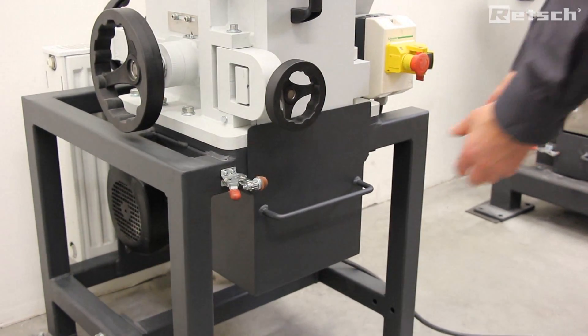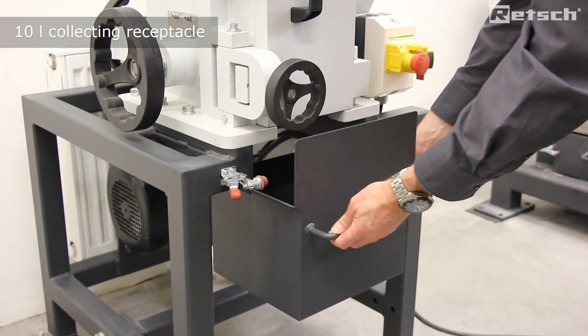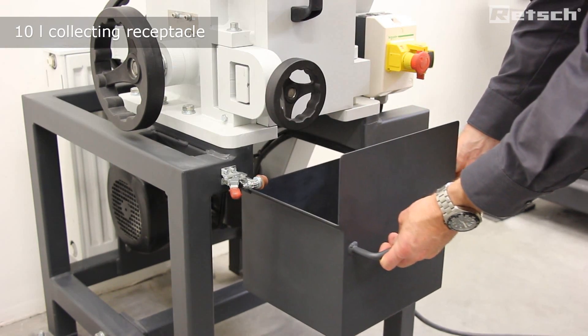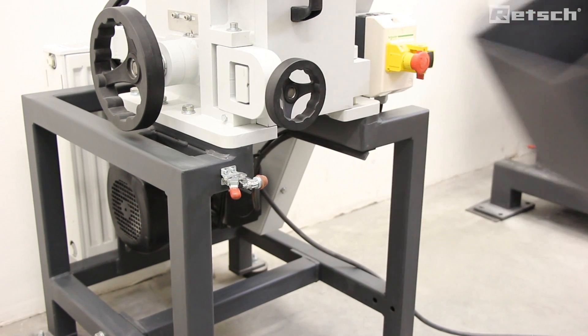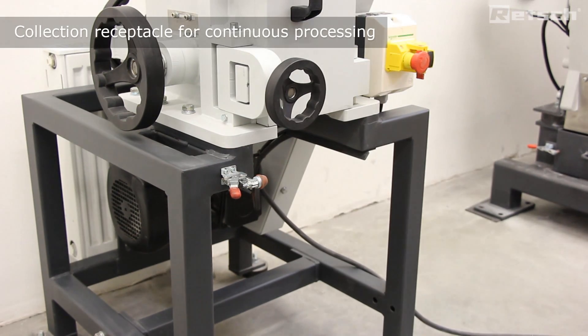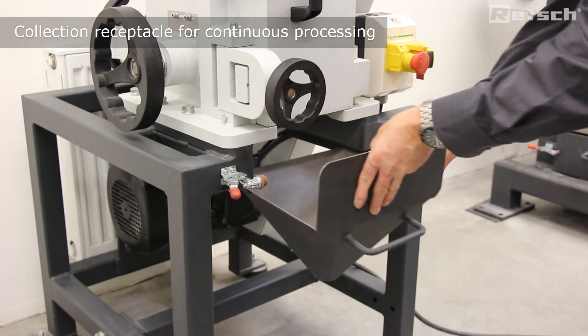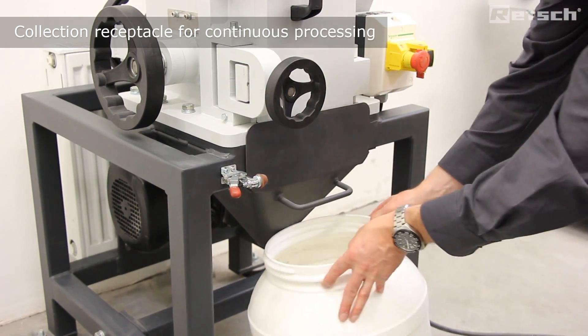Supplied with the instrument is a 10 litre collecting receptacle to collect the crushed material. It is positioned ergonomically at a convenient working height. A further optional accessory is a second collecting receptacle for continuous processing.